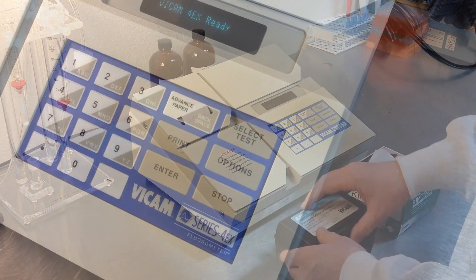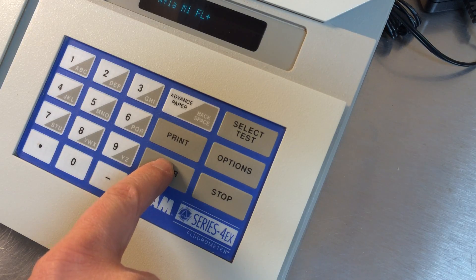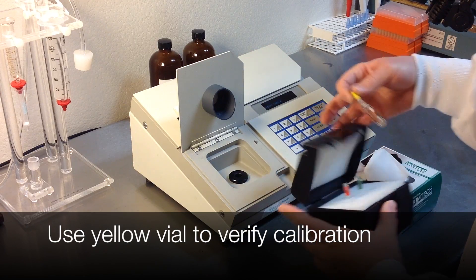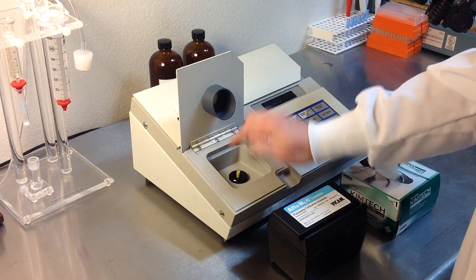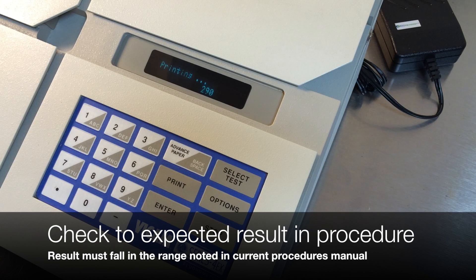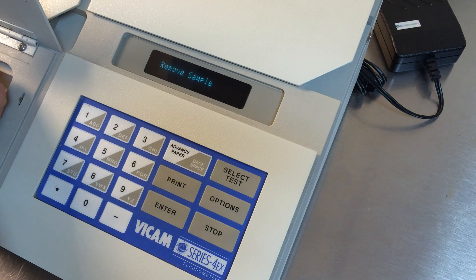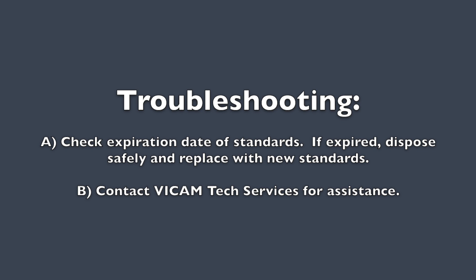Now we will test the calibration. Press Select Test and choose AFLA M1 FL Plus. Press Enter and insert the yellow vial. The results should be within the range indicated in the current procedures manual. If the result is out of range, first check the expiration date of your standards. If you need further assistance, contact Vicam Tech Services.